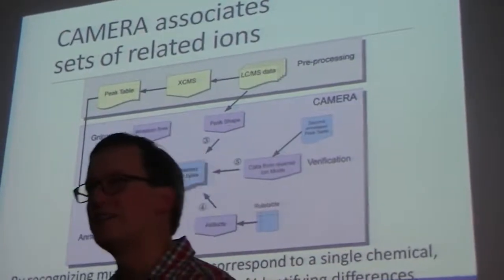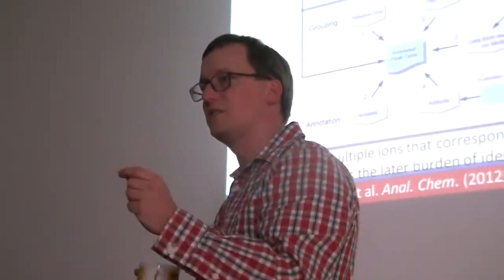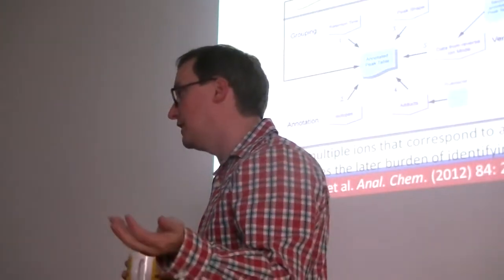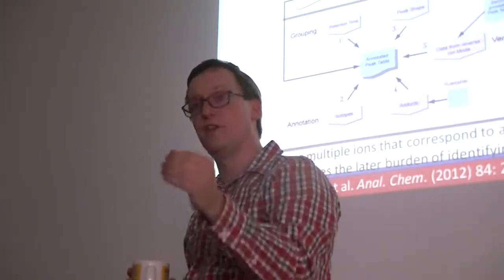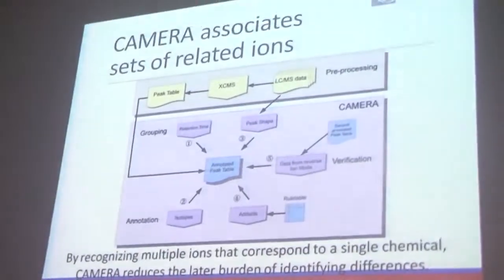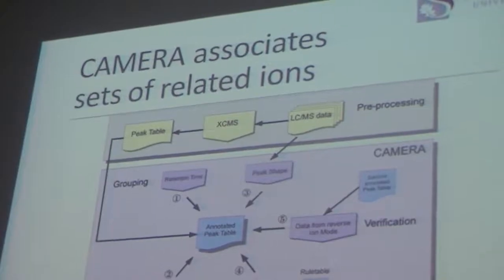We already talked about an example in an earlier figure where we may see different traces for a single chemical compound. That difference came about when we had extra neutrons in some of the nuclei of those molecules. So we were able to see isotopic variance of the same ion, which means that when you're looking at a region of interest, pretty much any metabolite you look at should have multiple isotopes visible to us, right?